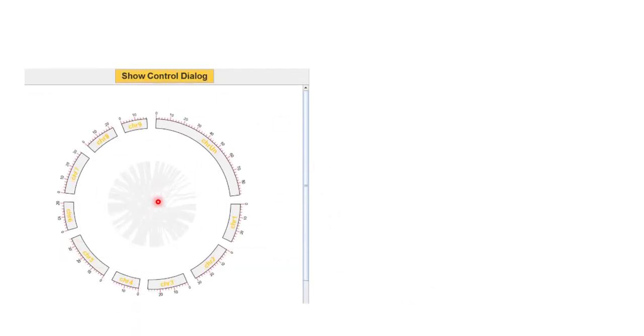You can see here we have chromosomes, and in the middle we will get all the gene pairs that are duplicates with different regions of different chromosomes. Because you see here it's localized in the middle, we can expand it towards the chromosomes.